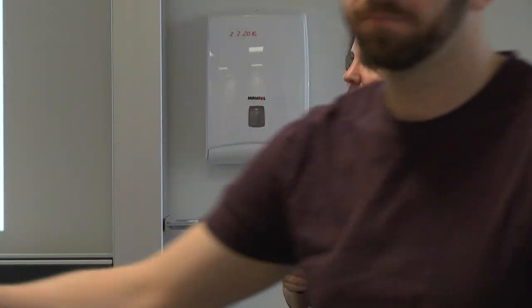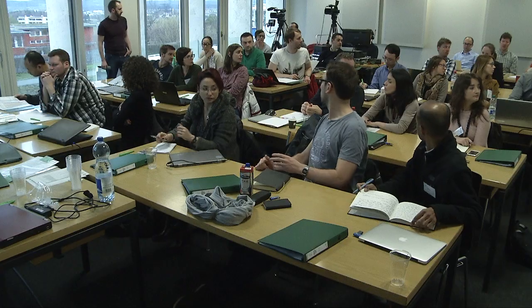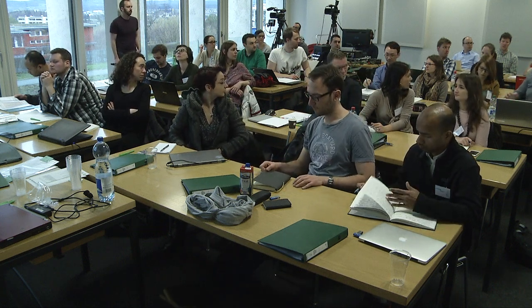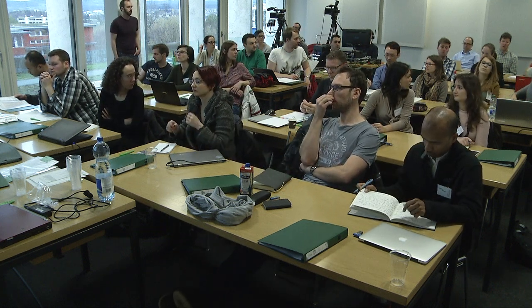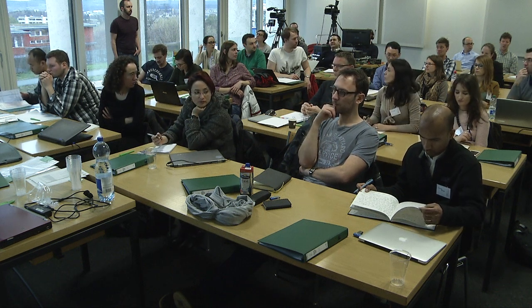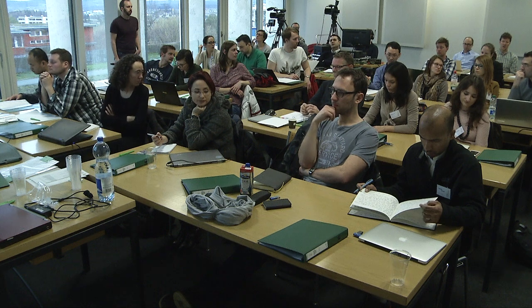So maybe I can comment quickly on this. We will also have a lecture on MSstats, and there we will go into how you actually combine those different peptides to get a protein quantification. And what is currently done, at least in MSstats, is actually median based. But we'll get to this.